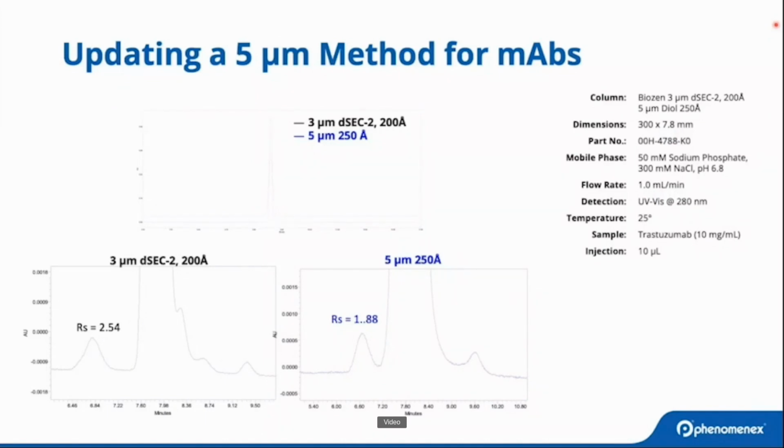What this does show us, though, is a reminder of exactly what gets improved when you go to smaller particle sizes. These smaller particle sizes are more efficient, as we can see in the improvement of the dimer from the monomer.